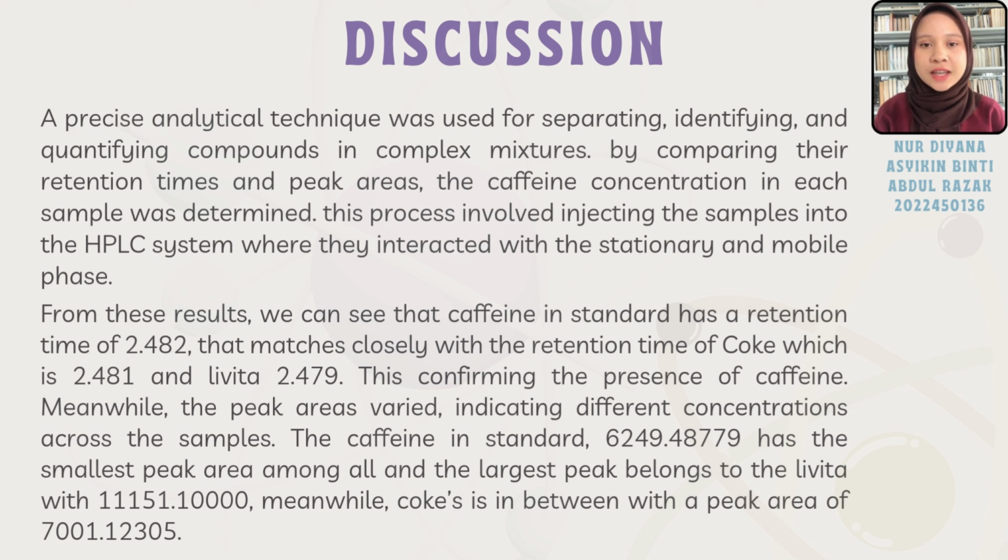The caffeine in Standard, 6249.48779, has the smallest peak area among all, and the largest peak belongs to Levita with 11151.10000. Meanwhile, Coke is in between with a peak area of 7001.12305.